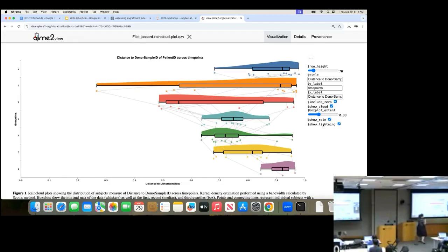Yeah, it is. It's totally. So these are rain cloud plots, and I think they're the coolest plots in the whole world. Not just these ones, but the idea of rain cloud plots, because they encode so much data variability for our visualization. So everyone is probably familiar with a box plot.